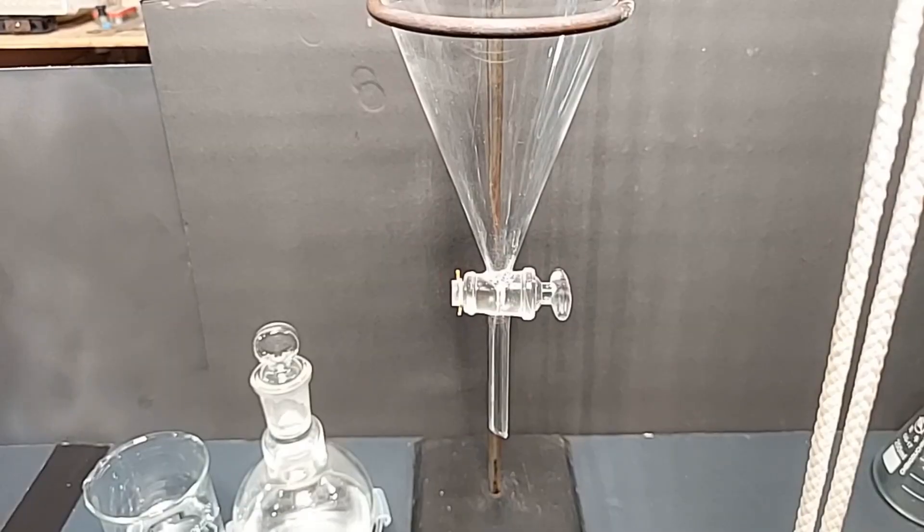I have the separatory funnel set up here for the next series of washes to clean up our ethyl acetate. I took a minute to set this up, so the ethyl acetate was actually put in the freezer for a bit while I did this and broke down the previous setup. So it's kind of chilly. The first wash is going to be cold water, 100 milliliters of it.